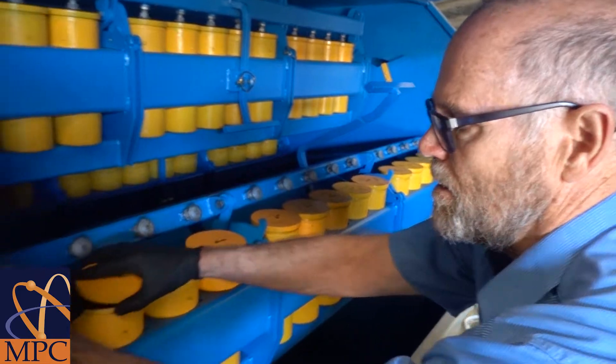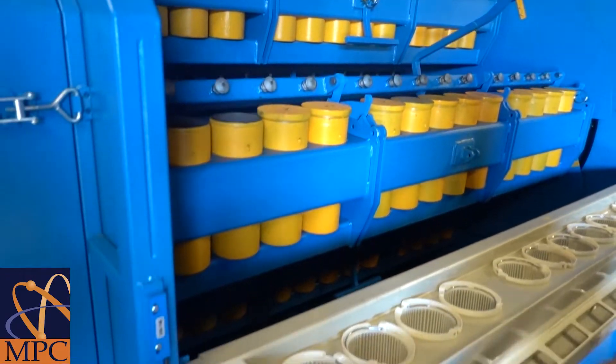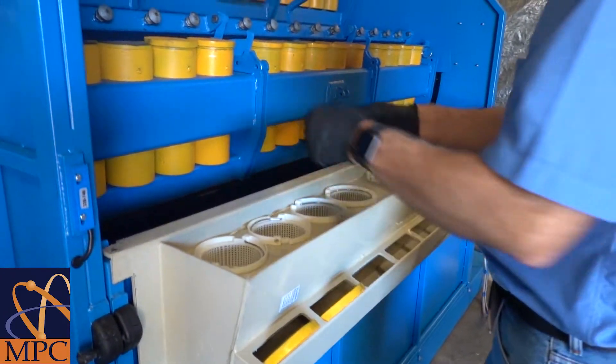The lids are then removed and placed into the trough on the front.